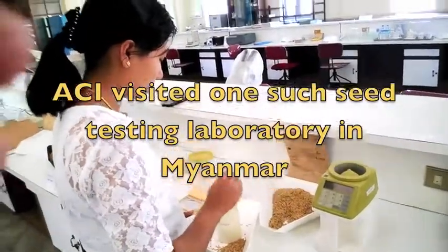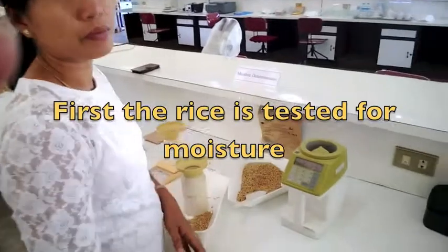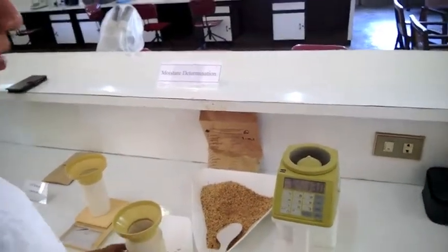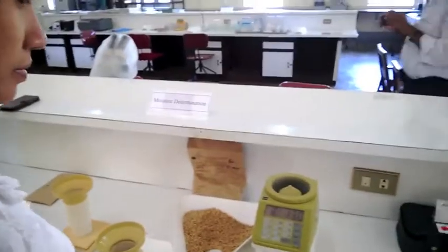The first step when you receive the sample is to measure moisture. You put it in this machine as the lady is doing. Here we have 13% moisture, so it's good. 13% is good — we can accept it. Otherwise they have to dry.